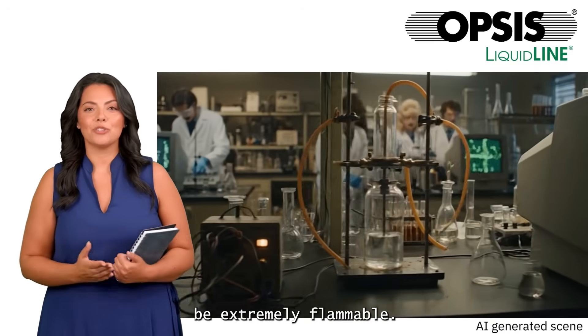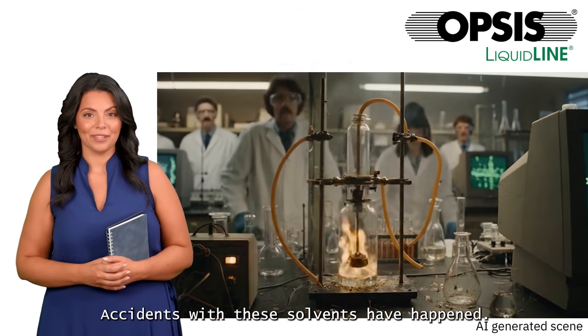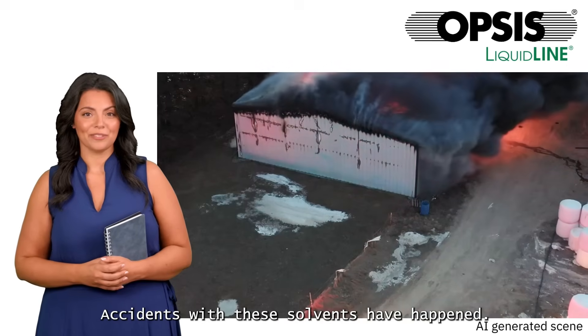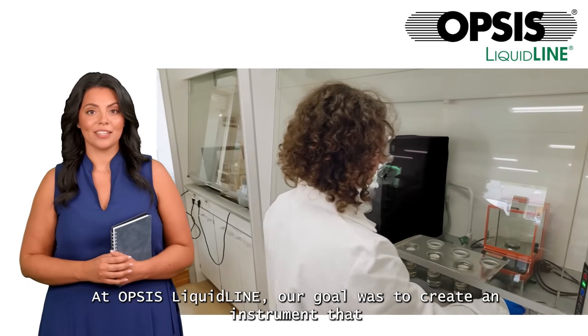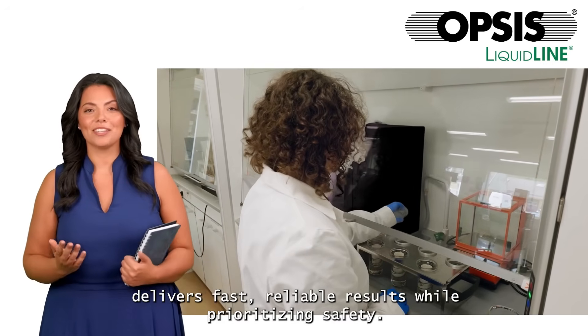Unfortunately, many of these are dangerous to inhale and might also be extremely flammable. Accidents with these solvents have happened. At Opsis LiquidLine, our goal was to create an instrument that delivers fast, reliable results while prioritizing safety.